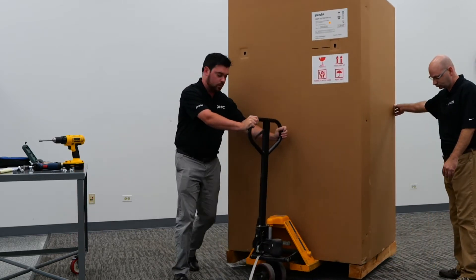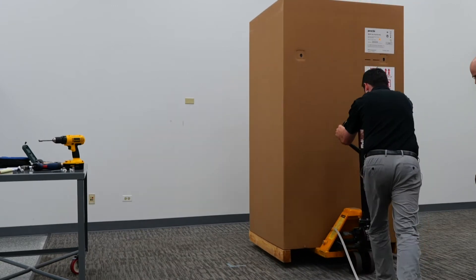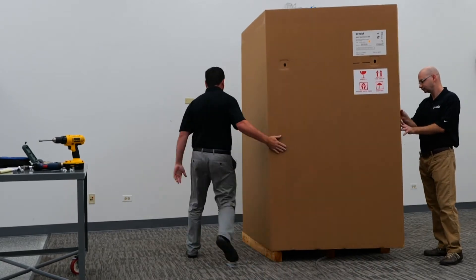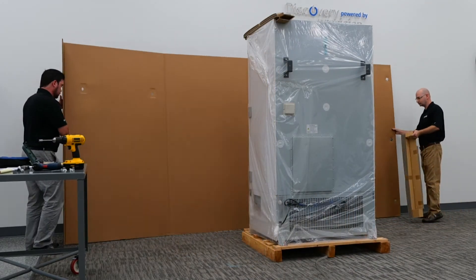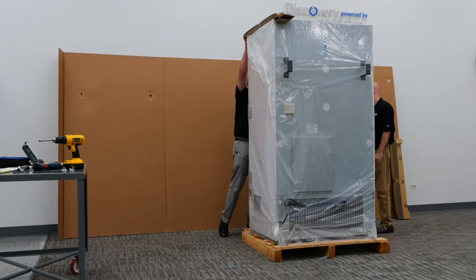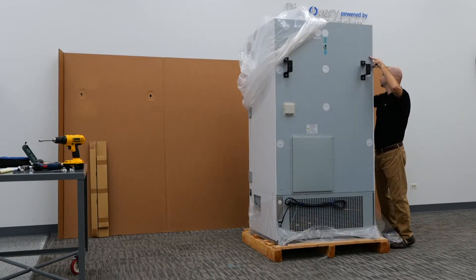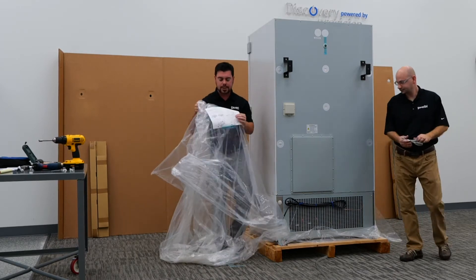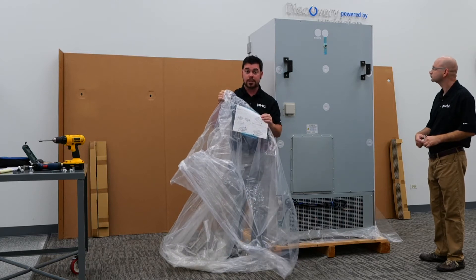Once those three screws are removed, we're going to be able to fully remove the cardboard carton. In addition to removing the cardboard carton, we do have a few pieces that we'll have to take off. You will also notice on the front of the bag a set of instructions which also highlights the process that we're going over today.